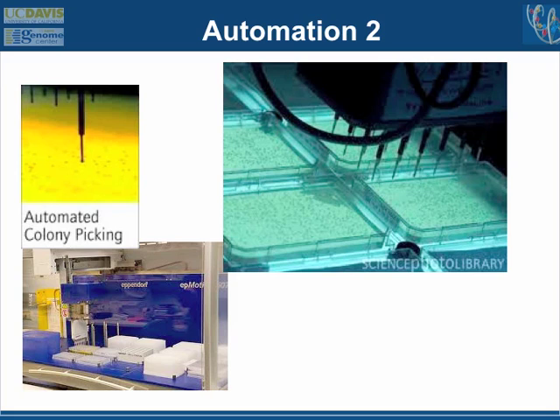We had, as we called them then, massively parallel undergraduates, picking colonies with toothpicks. Imagine picking 200,000 colonies with different toothpicks over and over and over again. It was really a great job. So robotics was really important for revolutionizing the sequencing approaches at the time, by allowing people to no longer have to pick colonies themselves, and you'd have a robot.